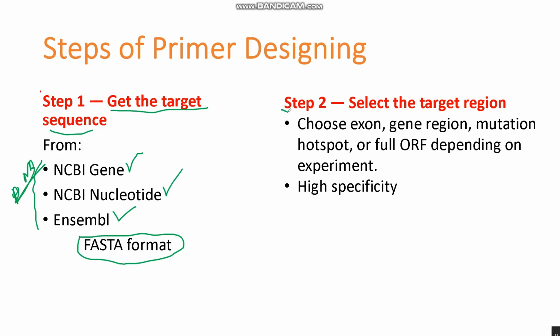Step two is select the target region. First get the DNA sequence or the gene sequence, and then select the target region.